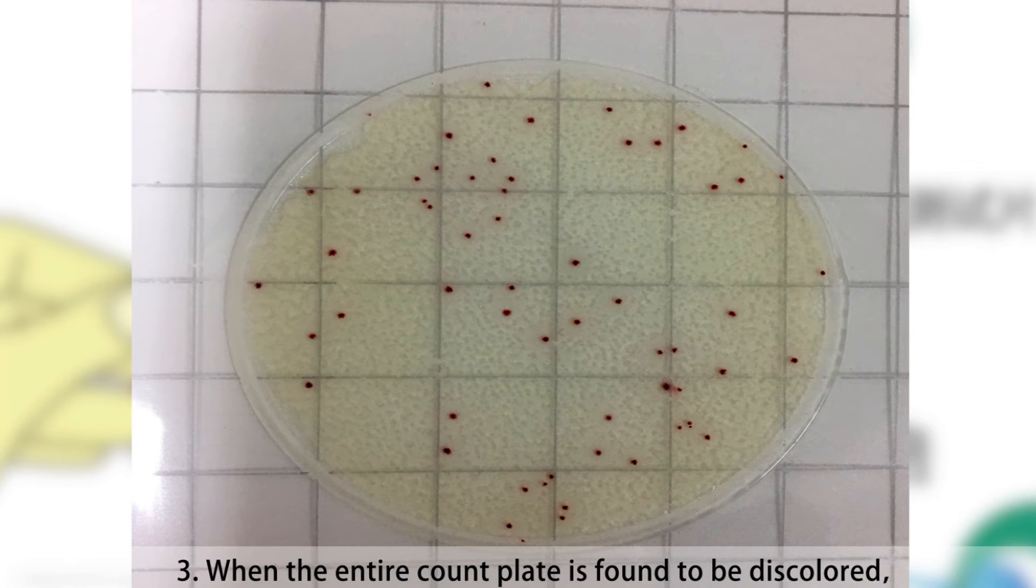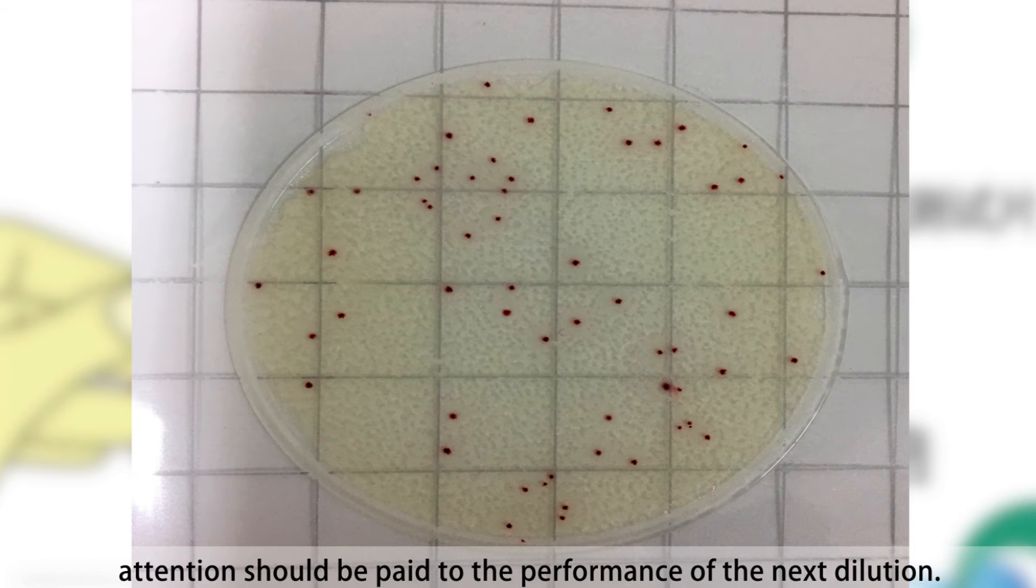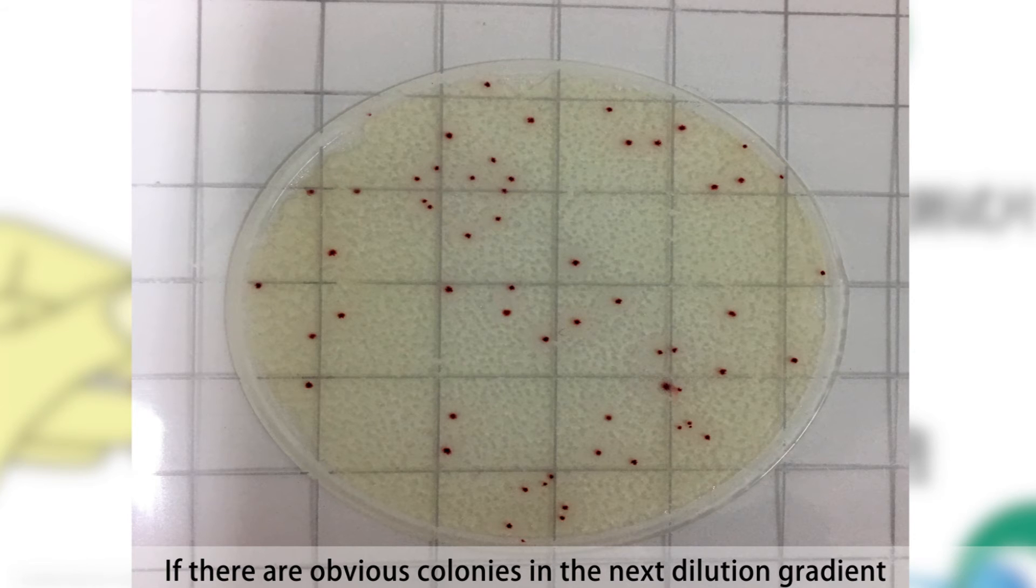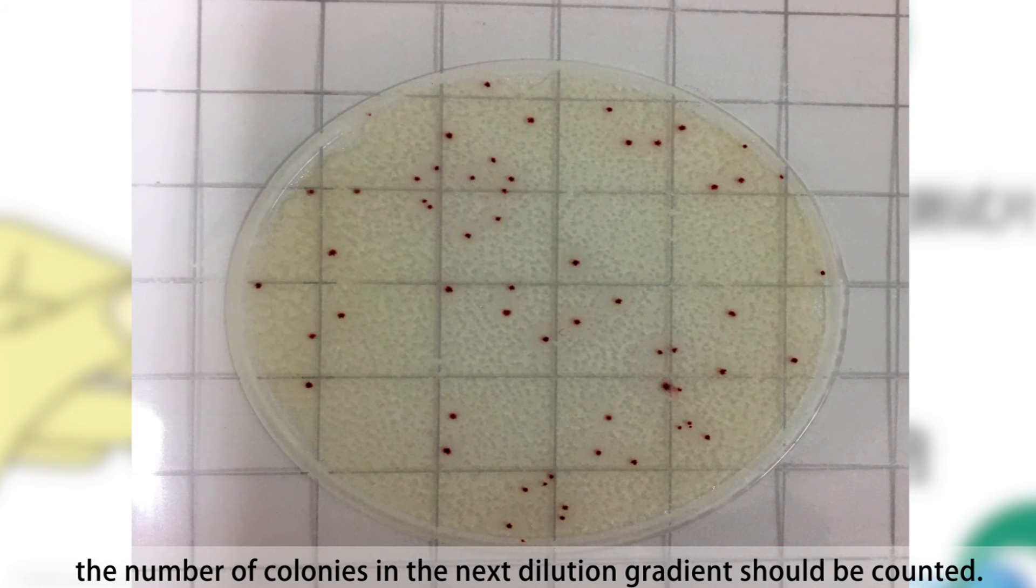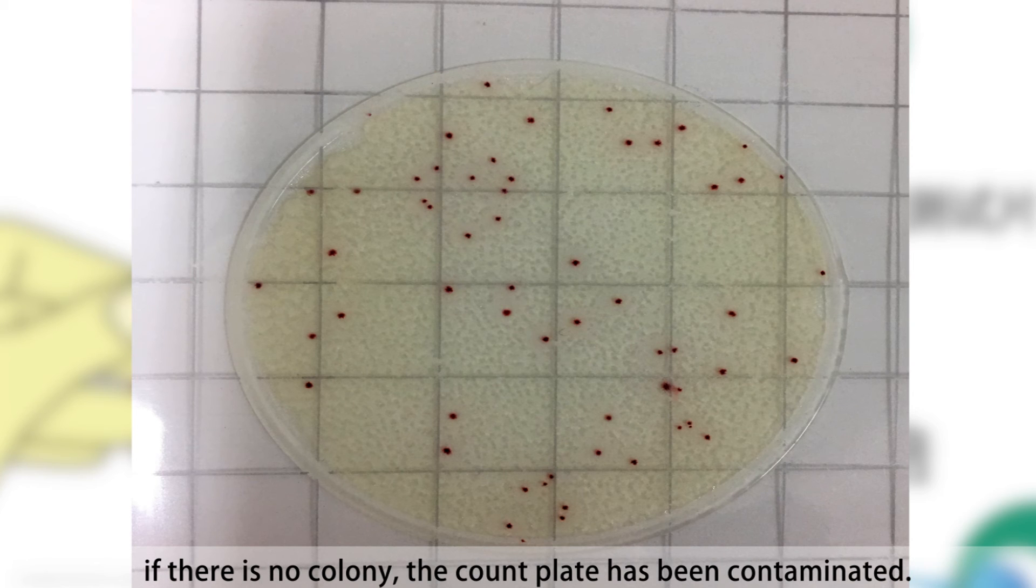Third, when the entire count plate is found to be discolored, attention should be paid to the next dilution. If there are obvious colonies in the next dilution gradient and within the optimal range, the number of colonies in the next dilution gradient should be counted. If there is no colony, the count plate has been contaminated.